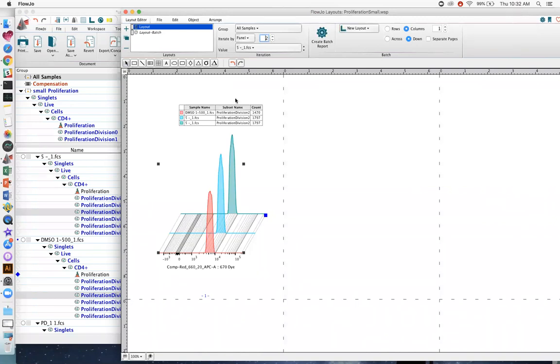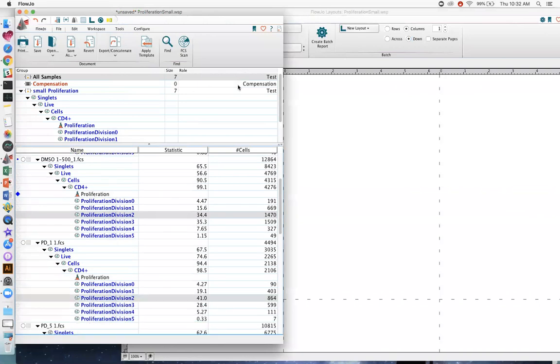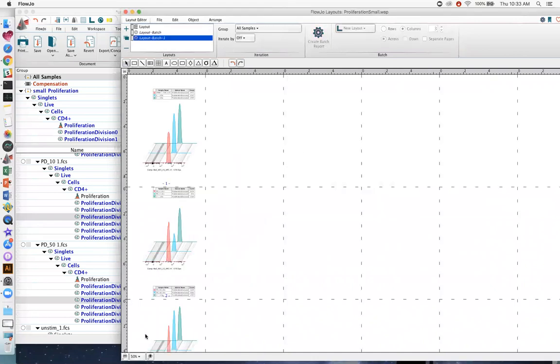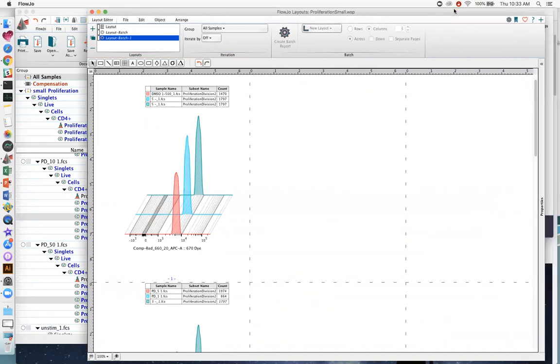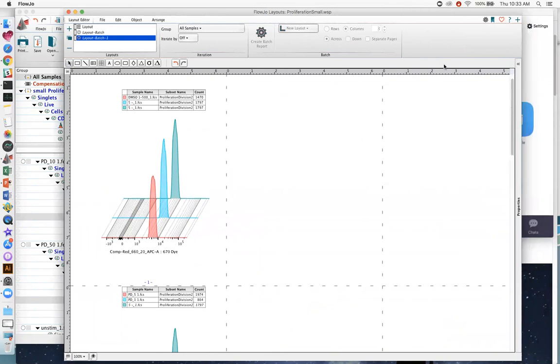all the while maintaining a lock on that first sample as a control. Okay, so we go here. Again, we'll make a batch report going columns down. And this kind of teal color is the one that's being locked in the background. You might use, I don't know, your undivided peak or something like that as the background.